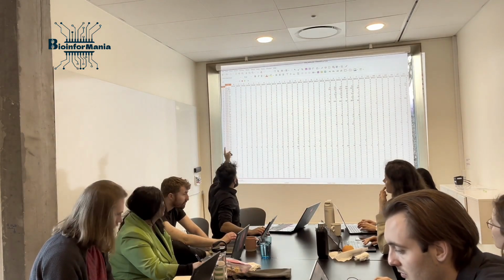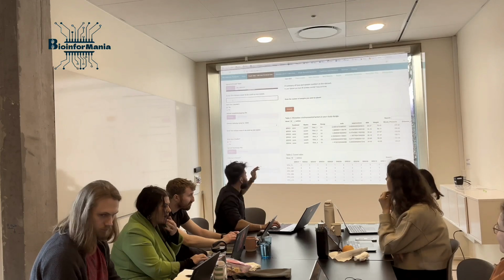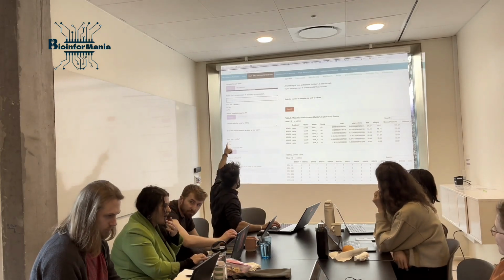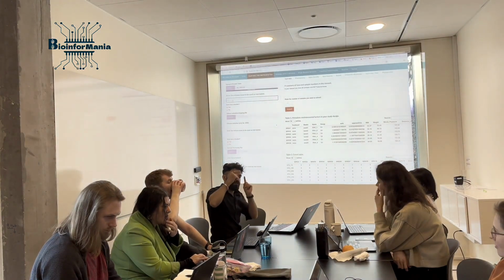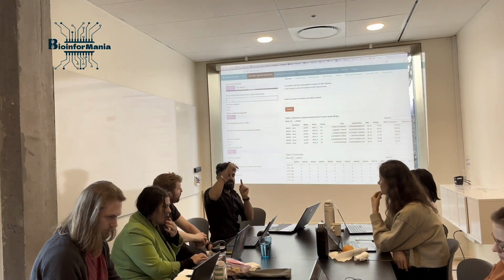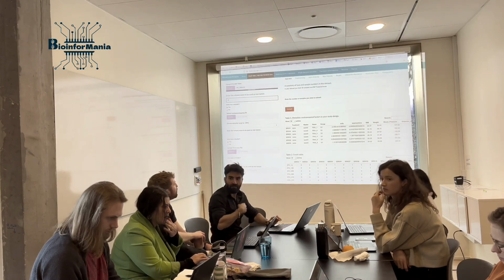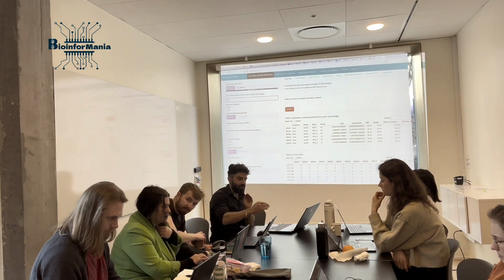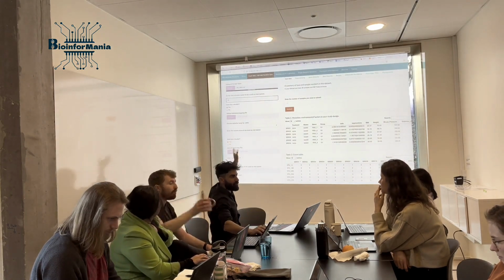And what is the importance of that? If you upload your own data, you enter the column name to be used as the row name. That's the name of the OTU's column, which we call ID. So the first column is what the software is going to use as your row name. Now you need to know to use it here.